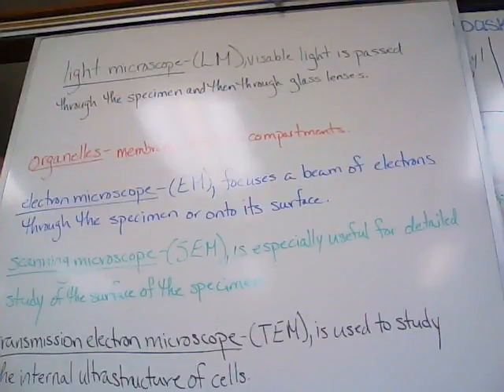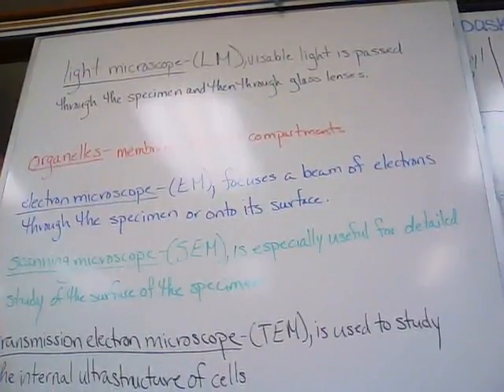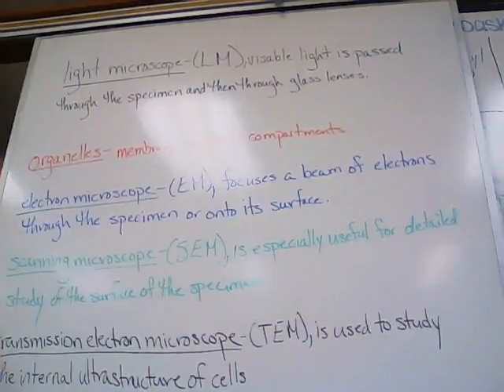The instrument used is the centrifuge, which spins test tubes holding mixtures of disrupted cells at various speeds. The resulting forces cause a fraction of the cell components to settle to the bottom of the tube, forming a pellet. At lower speeds, the pellet consists of larger components, and higher speeds yield a pellet with smaller components.